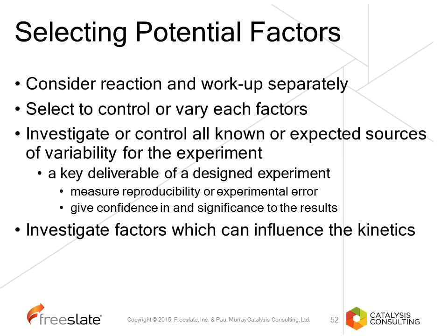If you carry out an experiment today and you get 95% conversion and get a good yield from that process, you have very little information other than that experiment worked. If you carry out the same experiment tomorrow and you get 50%, then there is a problem, and you didn't know the significance of the result in the first place. If you've carried out the same experiment multiple times and you get the same or very similar result, then you have much greater confidence in the result. And DOE does replication to help you to understand the significance of the results and give you confidence that you've investigated or controlled the right factors.